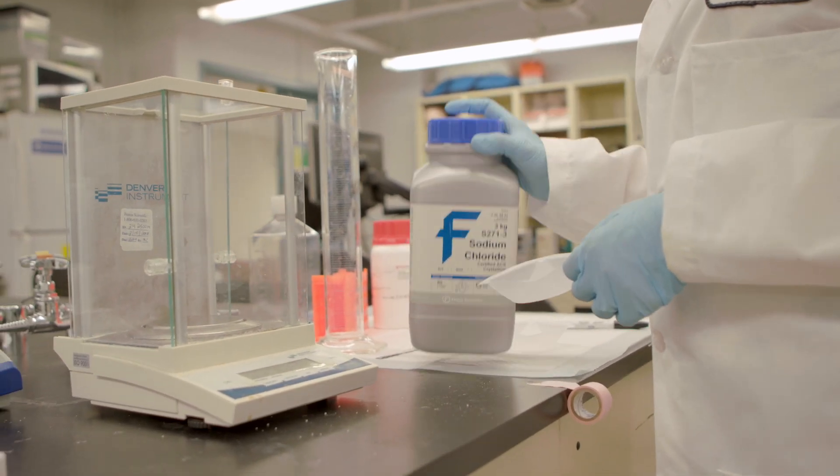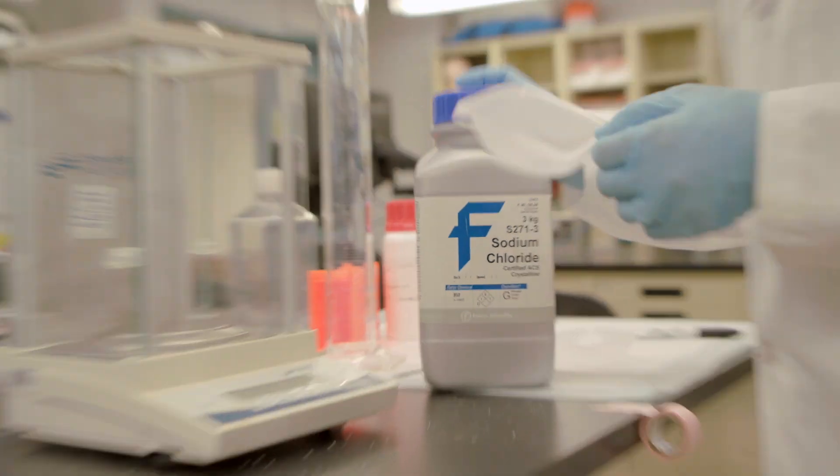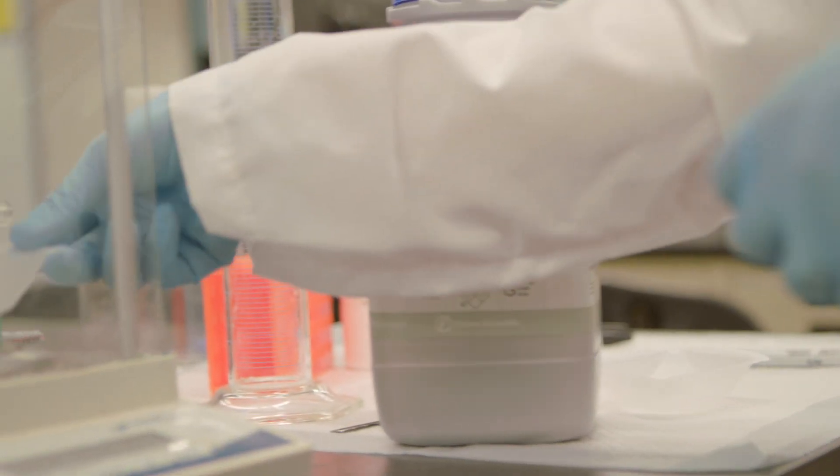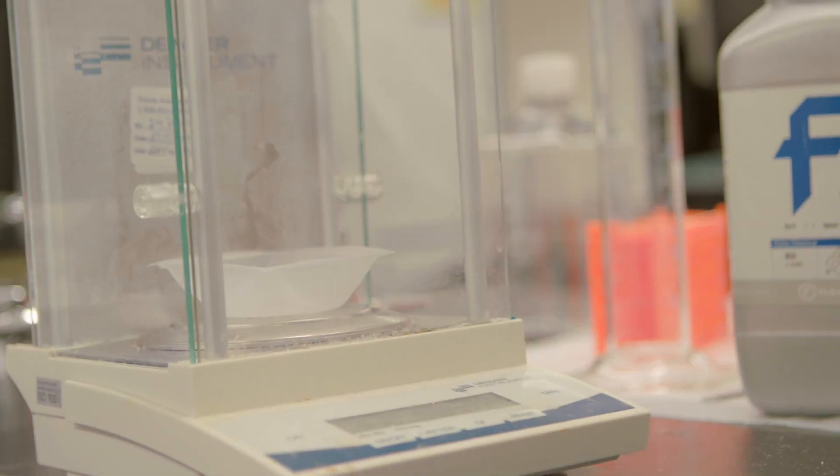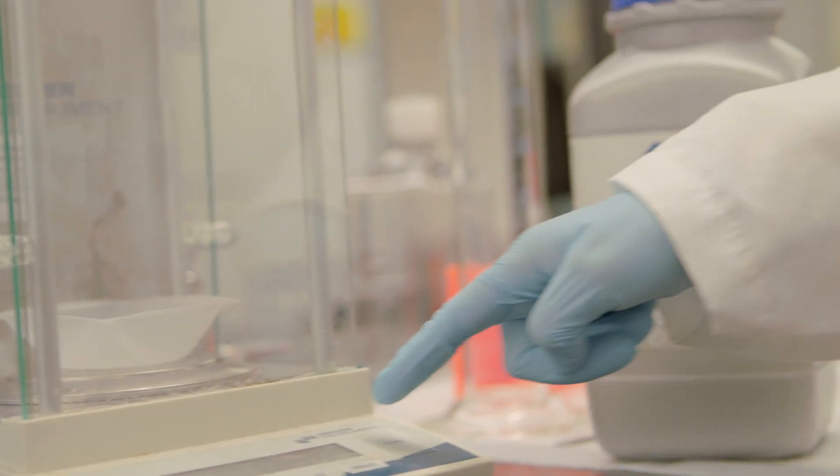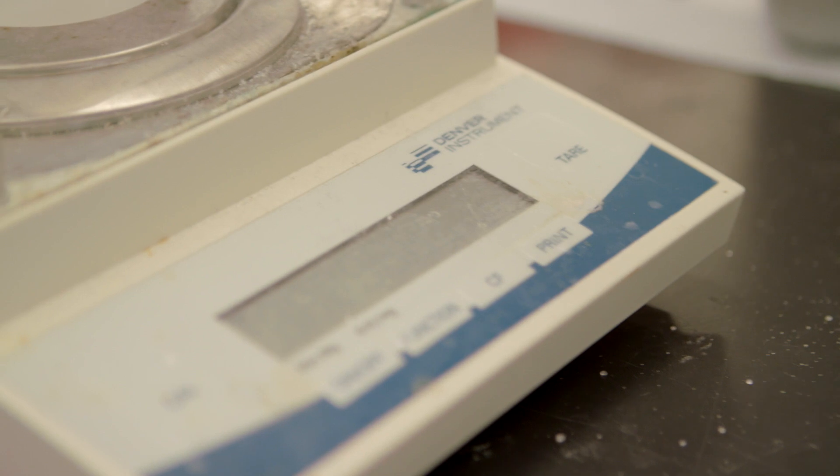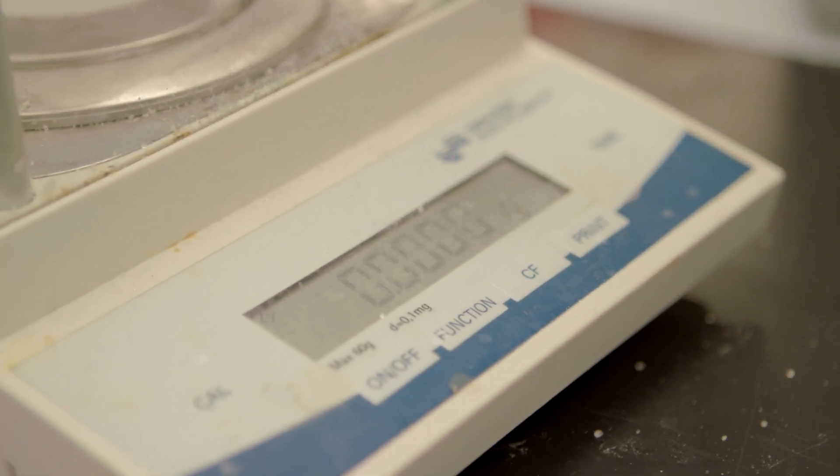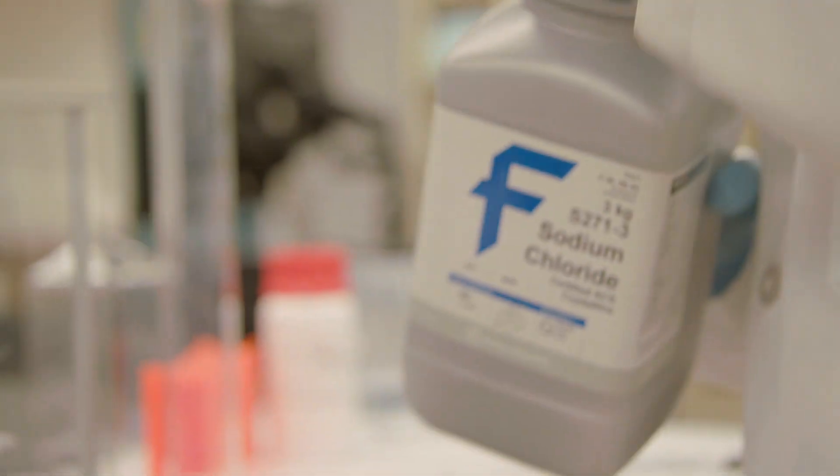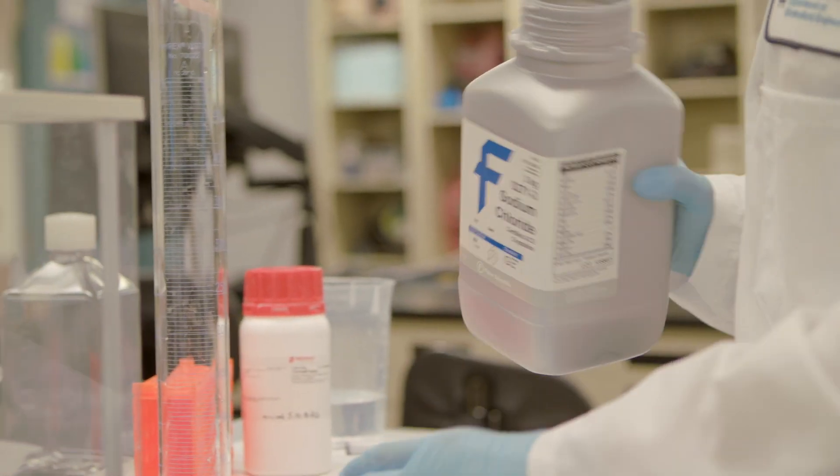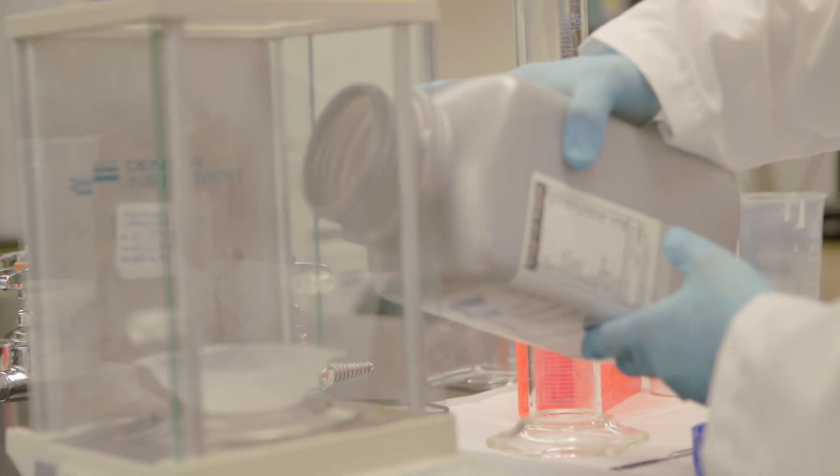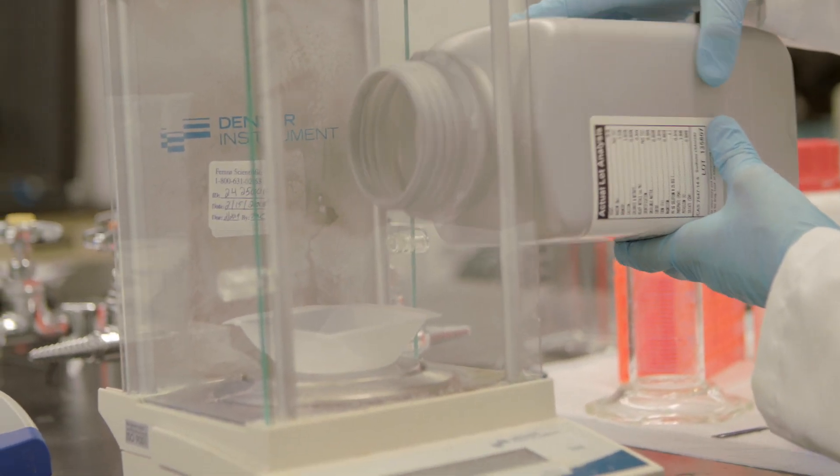Now, moving on to the NaCl, I take a clean weigh boat. Again, place it on my scale and hit tare again. This time I want 45 grams of NaCl. This is kind of a big container, so we'll see if I can pour carefully into here. No, I can't.